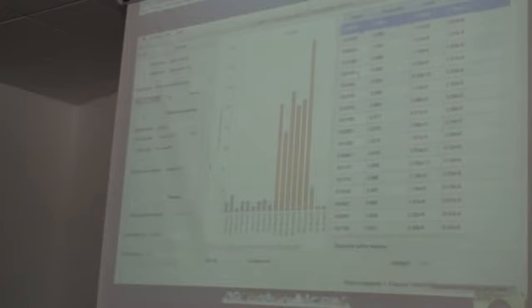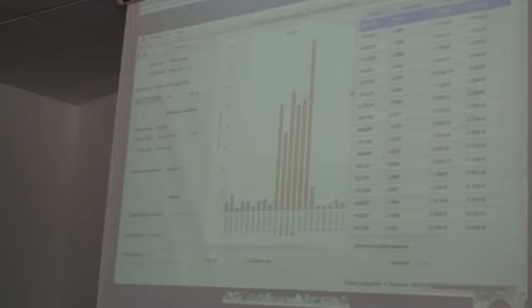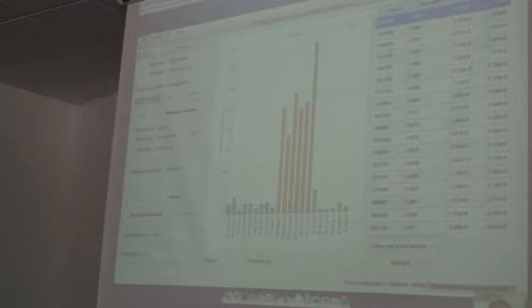Well, that's interesting. I have different KEGG orthologs. Oh, I must have done a correction yesterday. Okay, that doesn't matter. But again, we have the p-values here, and then we have different KEGG IDs as well. Sorry, in my demo I have different KEGG orthologs coming up as most significant, although that doesn't matter too much. Perfect, okay. So we'll assume that these are the most high-ranking, statistically significant KEGG orthologs.